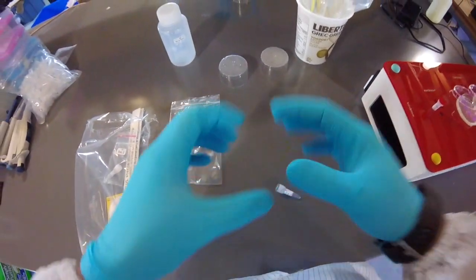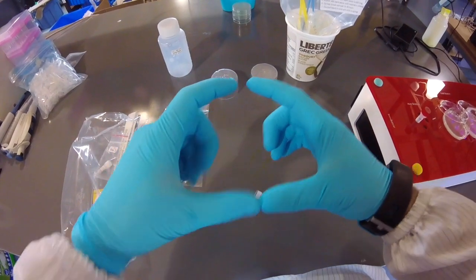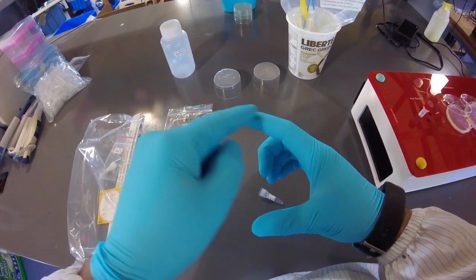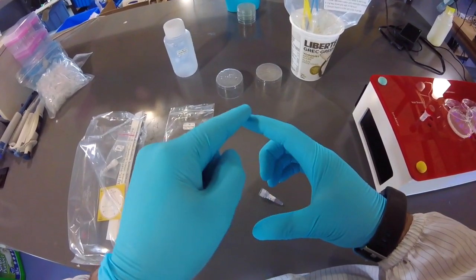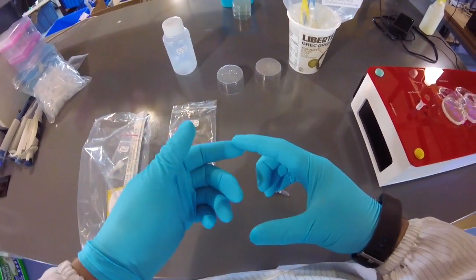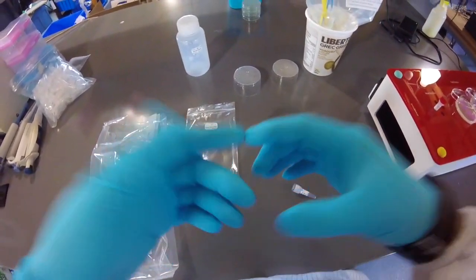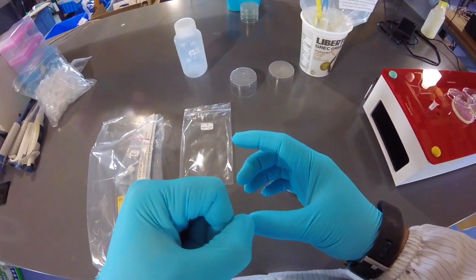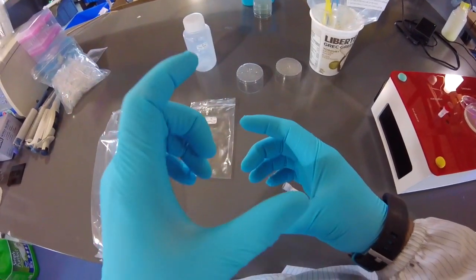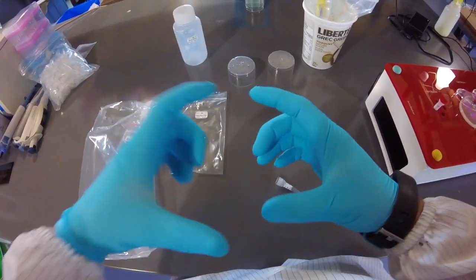and yet those little tiny loops of DNA typically have 3 important factors in them. One would be the gene of interest. A gene is a snippet or segment of DNA that is ultimately responsible for creating something in the cell. This could be a colorful protein, like what we're doing in this experiment, or it could simply be some RNA, right? But really a gene is a unit of DNA that has all the information that the cell needs in order to create something, okay? So there's the gene of interest, our color-producing protein.